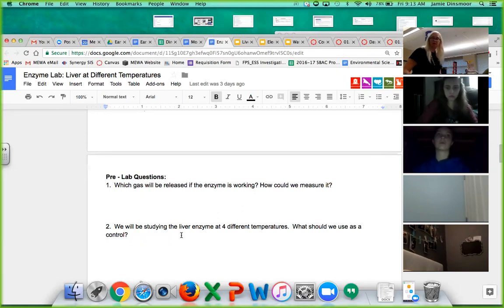What were the temperatures again? I'll repeat them, give me 1 second. It's hard for me to talk and spill stuff out with water at the same time.